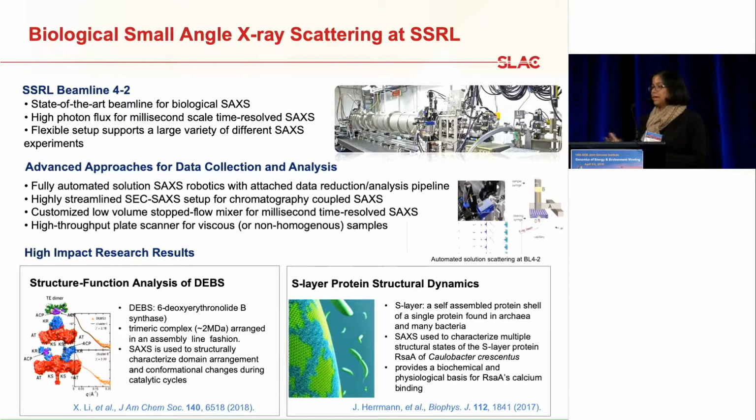So we can do millisecond time resolved experiments. And the way to think about using SAXS is not only macromolecules, but any nano-ordered structures such as wood systems or lipids or various large molecules in action. And the key here is that you're looking at solution level structure, not something that has been crystallized.